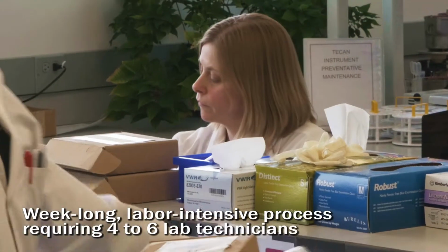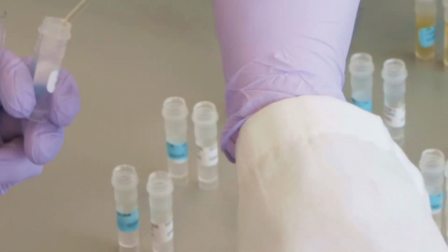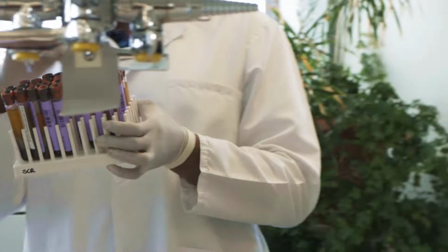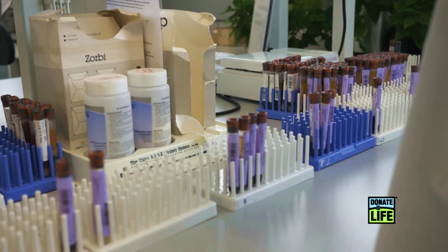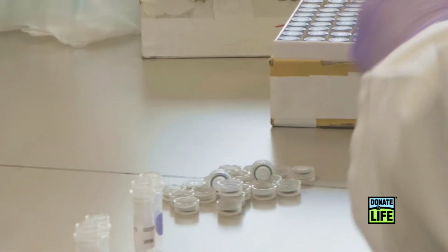Every month we dedicate a week so that the techs can aliquot the samples, and usually we have to use 4 to 6 techs at a time to do the laborious work of having to put the samples from the tubes to the vials. Not only do we have to do the transferring manually, there's a lot of risk of the samples being splashed. The risk is that some of these patients might have an infectious disease because these are patients from all walks of the world, so they may have something contagious that can be transferred to us while we're trying to transfer the samples into the vials.